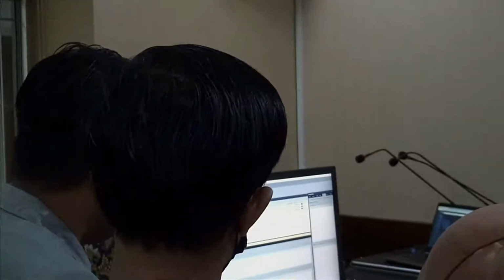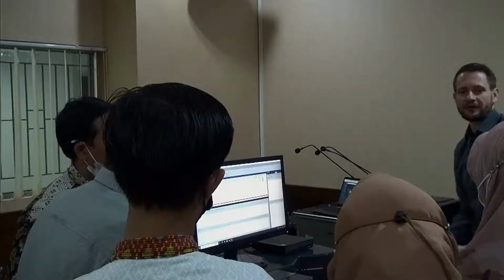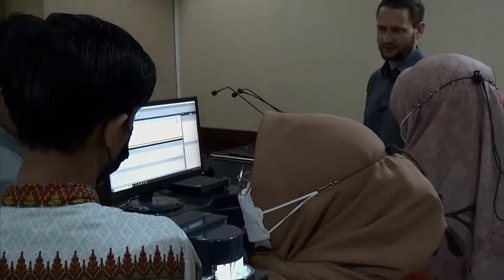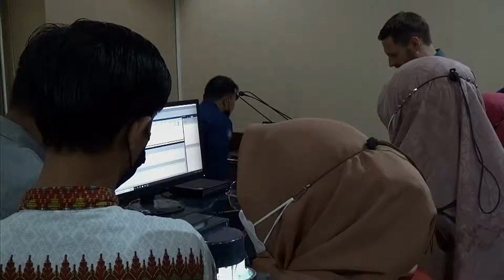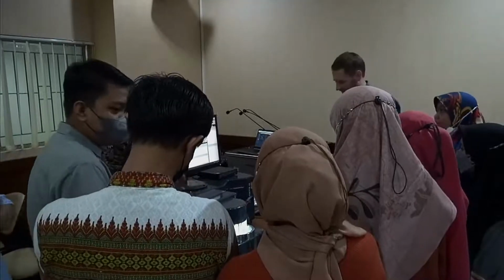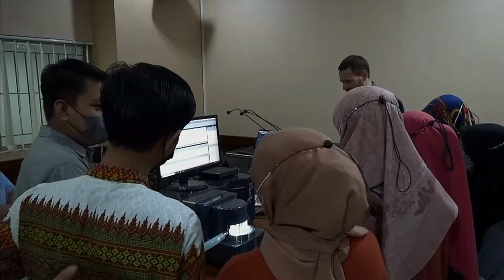I'm very satisfied with that. Of course, we will also measure other things, because it would be a little bit unfair just to measure something that we've measured 120,000 times, where we absolutely know what the outcome is and how it works. As I said, this is a very easy sample. We will now work our way to more difficult samples, and also show you some of the challenges you might encounter when using such an instrument. But we'll take it slow.